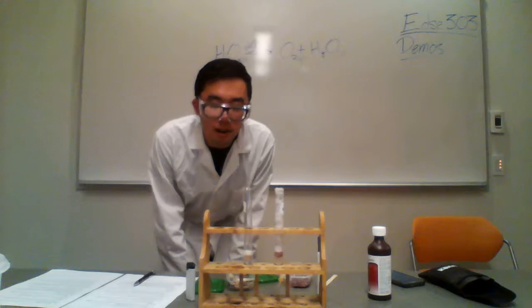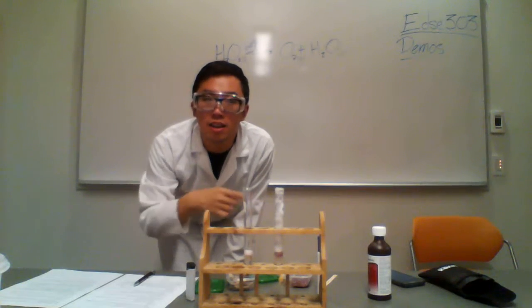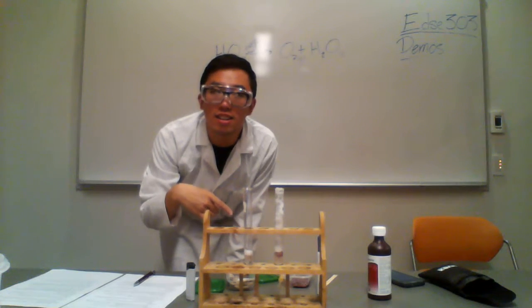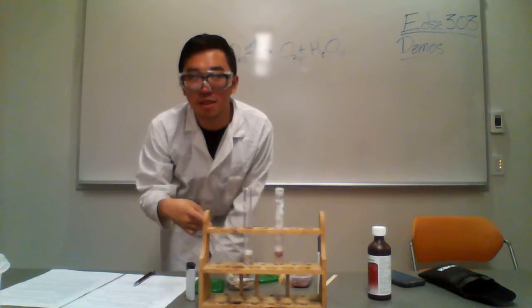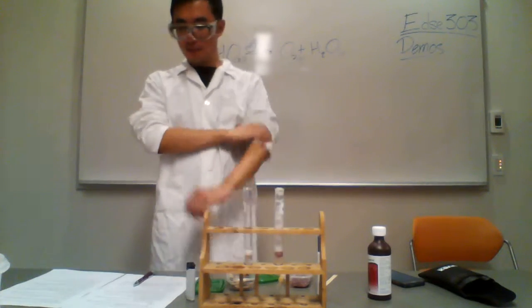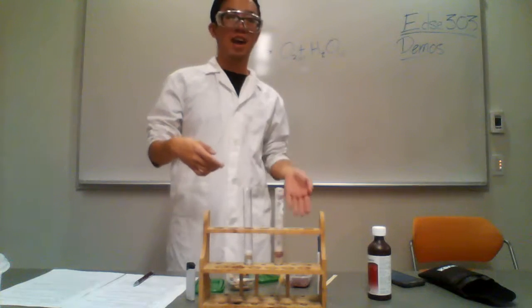So yeah, what part of this reaction, what part of the enzyme do you think is being affected the most by the substrate catalase? If you were paying attention in class earlier, the active site is what's being affected the most. So yeah, and why is that? It's because peroxide is the substrate for the catalase enzyme.